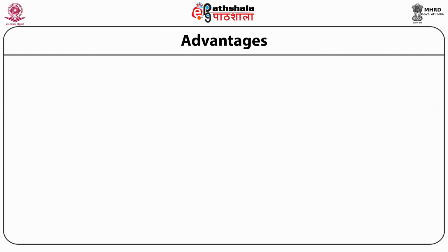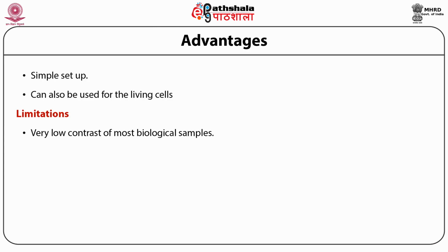Now, let us see the advantages and the limitations of the bright field microscopy. First, the advantages. It has simple setup and can be used for the living cells. Its limitations consist of very low contrast for most biological samples.